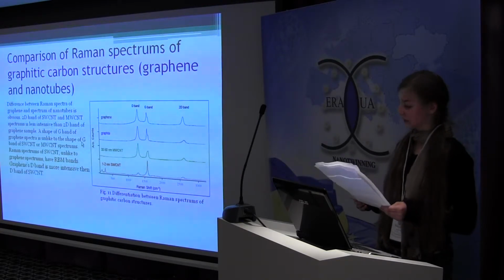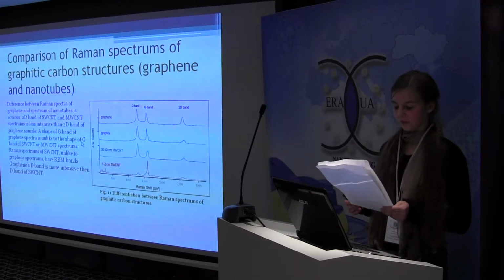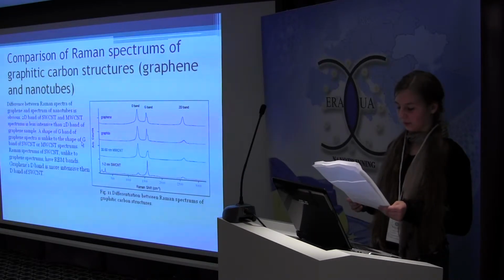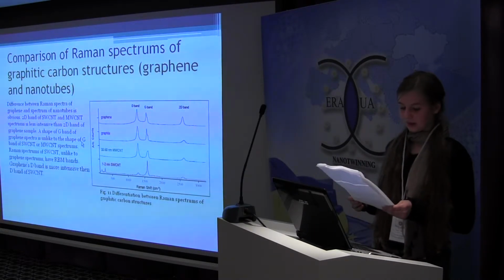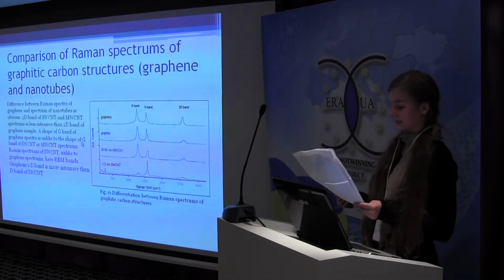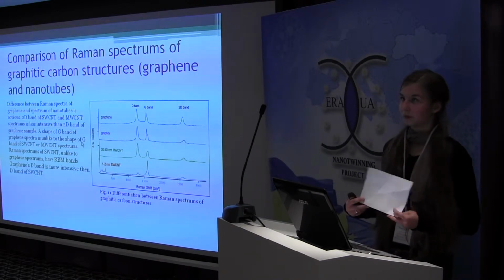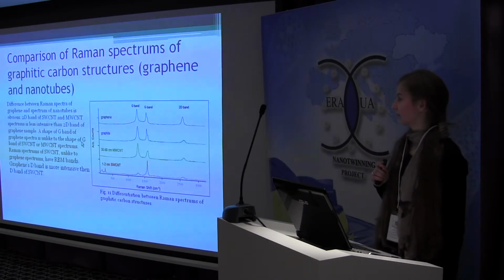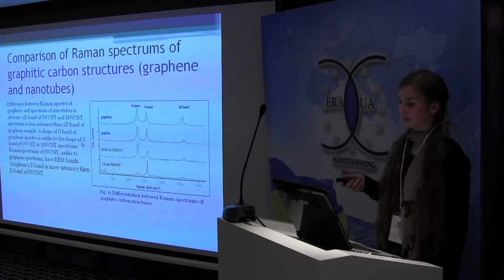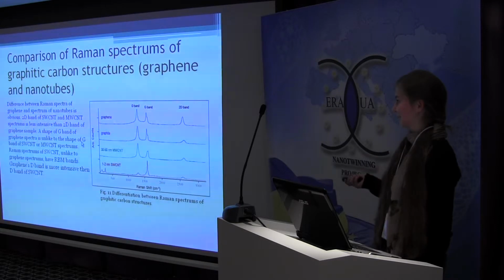In order to better understand its quality characteristics, fast, reliable techniques that deliver the right property measures are needed. Raman spectroscopy has emerged as a key technique for studying this exceptional material. That is why it's very important to know the Raman spectrum of graphene and the difference between it and other graphitic carbon structures. That's all. Thanks for your attention.